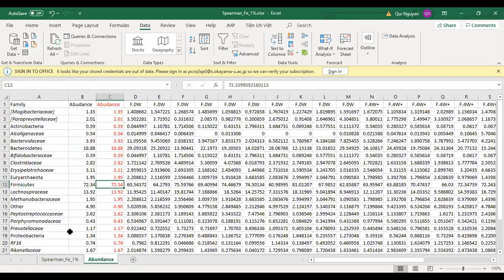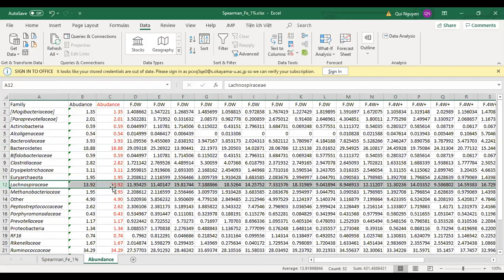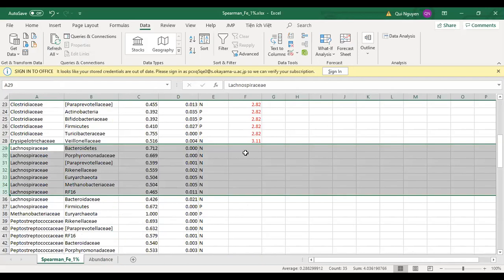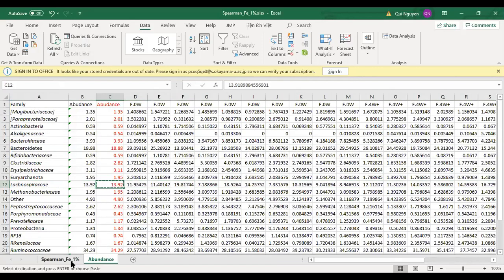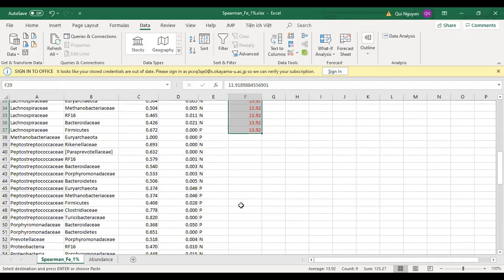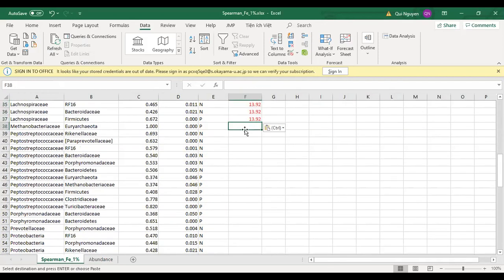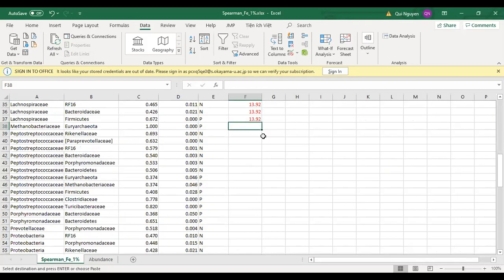Delete this. Delete. Then Methanobacteriaceae, and so on.